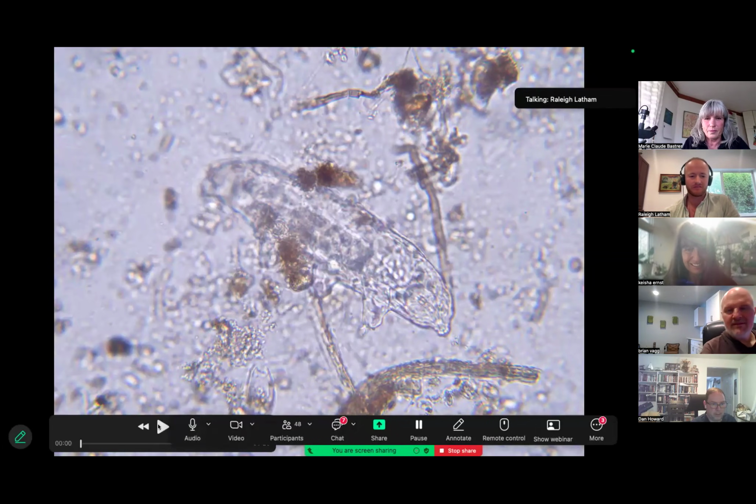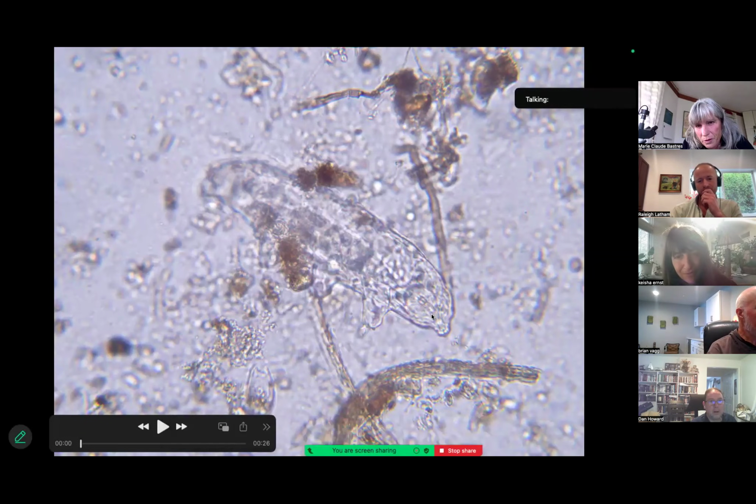Hey, there we go. There's our friend. Hey, buddy. So this is the mouth, right? Right in here, the mouth. This is maybe the pump to suck. And these are the little, how do you say in English?